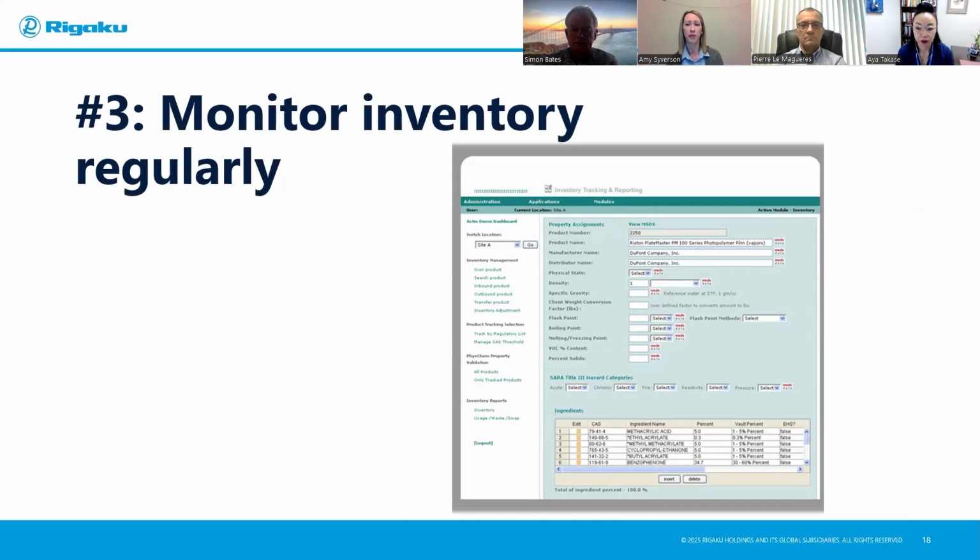Staying on top of your inventory is going to be key to keeping up with the demand of the different stock solutions. Whether your lab uses handwritten lists, Excel files, or maybe something more advanced, it's essential that you keep it accurate. A lot of times we forget, if something became contaminated, to go back and check it out of your inventory, so that you don't go to use it in the future and forget that it was disposed. We're going to link here a very good, basic inventory management tool that you may want to check out and look into for your lab.